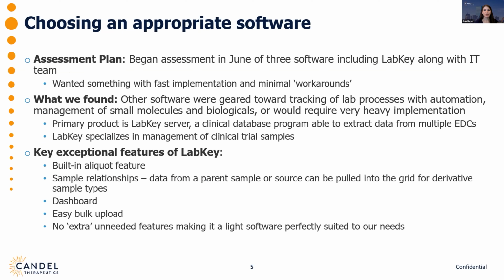So we did demos with a handful of companies and found that Sample Manager had both the software and the experience that most closely matched our needs. The other softwares we saw were more geared toward the tracking of lab processes that use a lot of automation or management of repositories of small molecules or biologics. And often, they'd require the software company's involvement in the implementation. But because LabKey Sample Manager comes from LabKey's other products, where they have this really extensive experience in supporting clinical trials like ours, it was a clear fit for us for our applications.